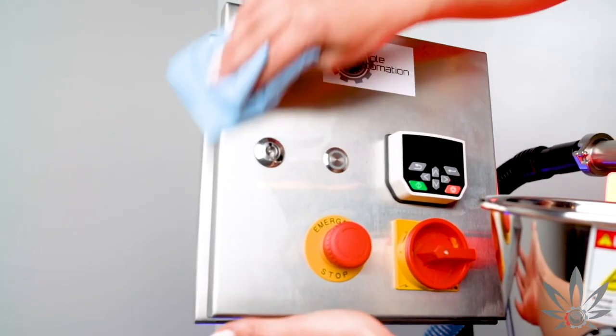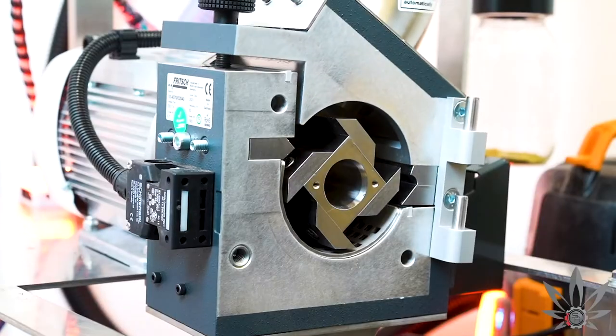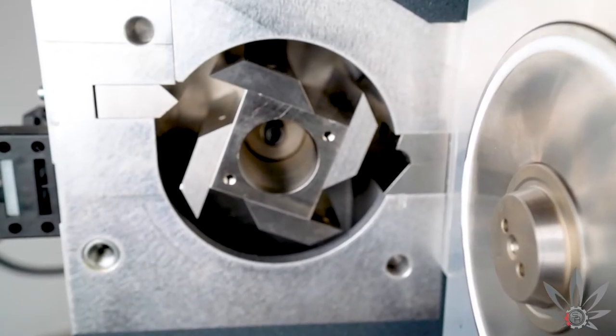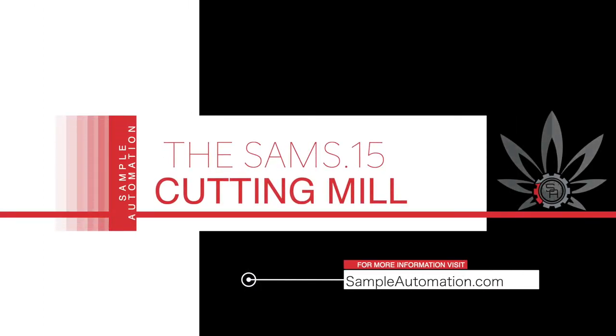The blades can be removed entirely and the cutting chamber opens completely, which facilitates easy access and cleaning. Visit SampleAutomation.com for more information.